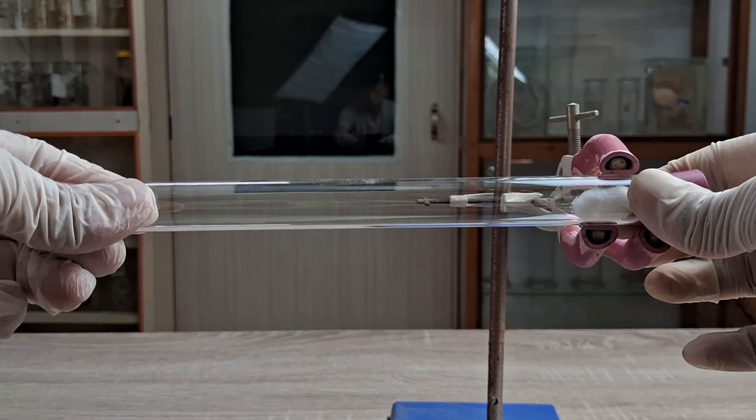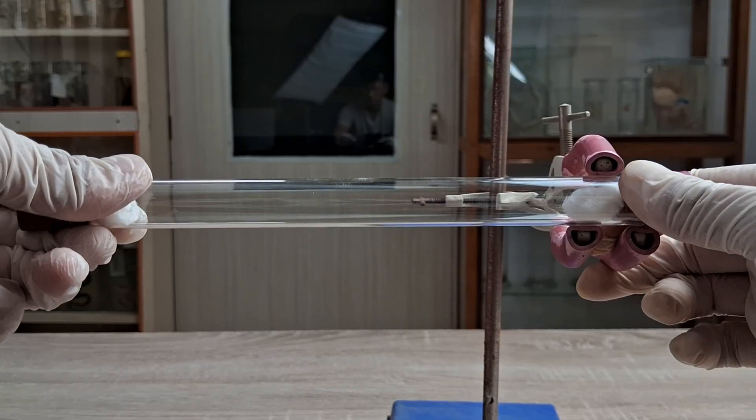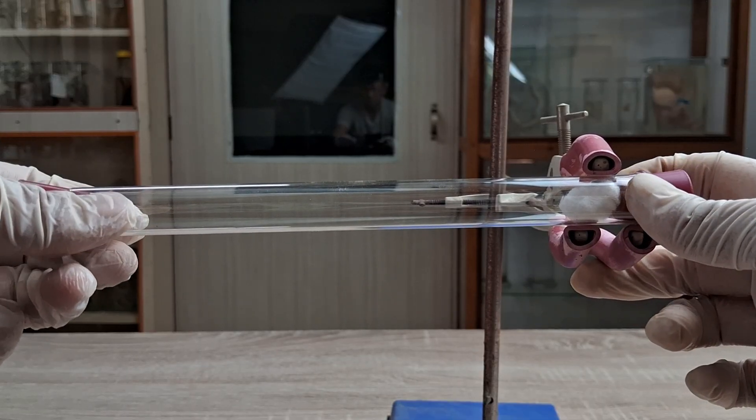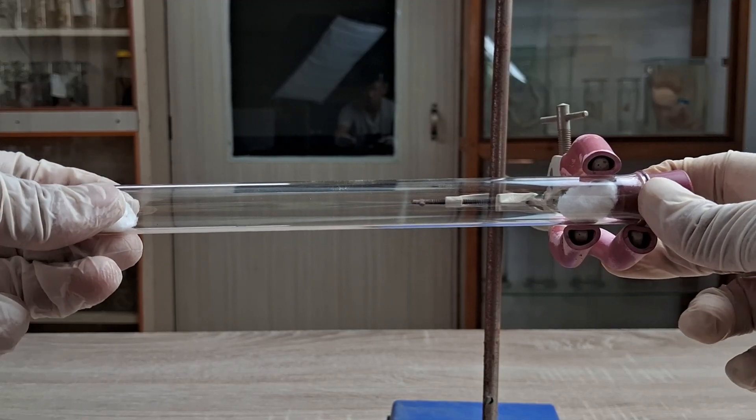As soon as you introduce the two cotton balls into the tube and secure the rubber stoppers, you will observe a thin white cloud ring starting to form somewhere towards the cotton ball dipped in hydrochloric acid in the glass tube.